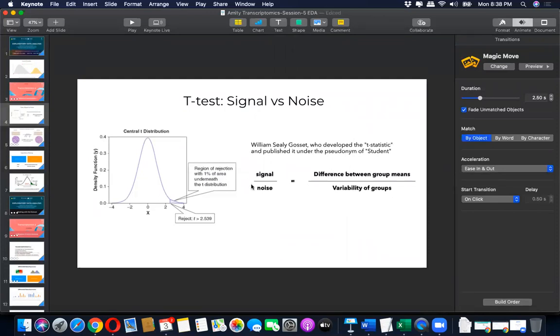So this is the signal that we want to find out, and we would like to remove the noise. That noise can be there because the data has been generated by someone else. It could also be due to the fact that there could be different types of limitations within one experiment.